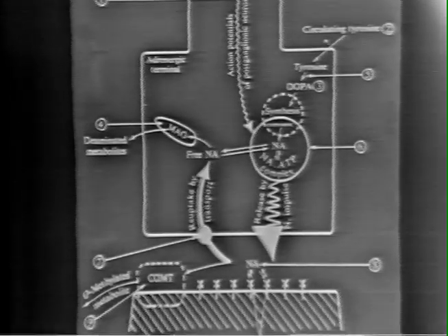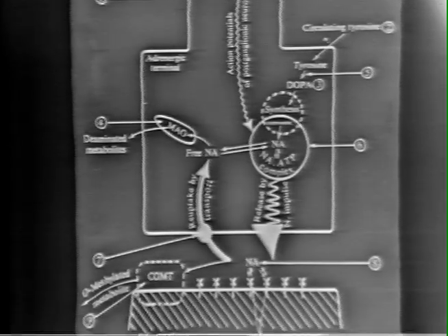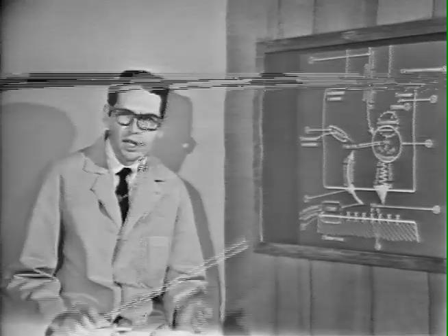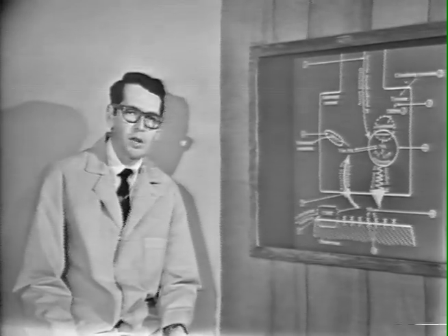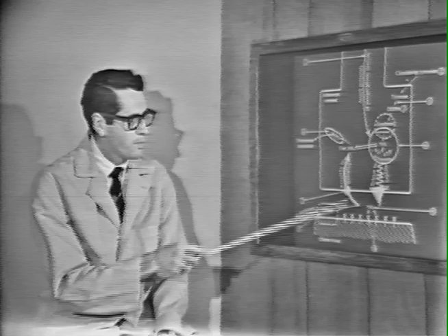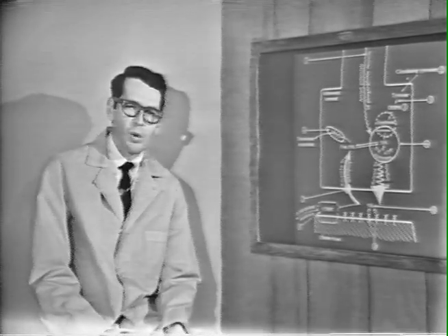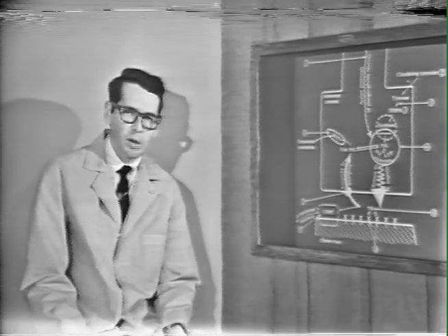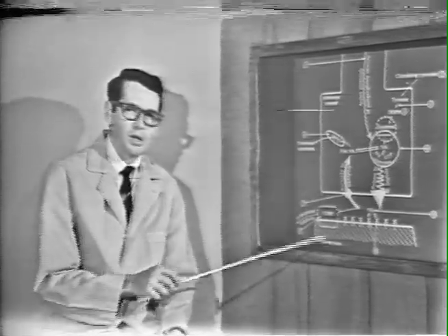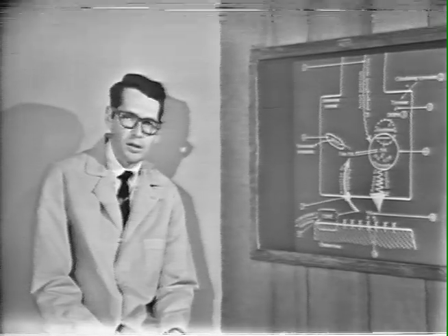We have seen then that we were able to use this physiological preparation to demonstrate two aspects of pharmacology. First of all, what is the physiological basis for the pharmacological responses? That is, what are the mechanisms involved in neurotransmission? And we have used drugs to reveal these processes. And secondly, what is the basic mechanism of action of some of these drugs? We were able then to couple the physiological system with the use of the pharmacological approach to obtain an idea of these mechanisms.